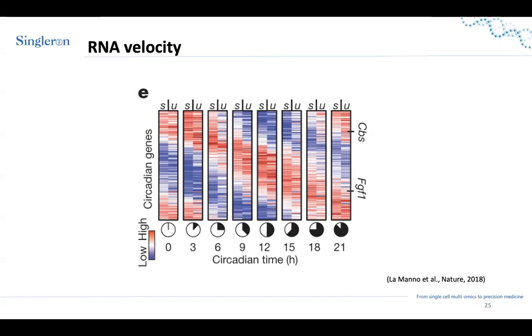And if you see that you have cell cycles, like if you have a cell culture, you definitely have cell cycles there, then you need to use a method that can detect the cell cycles.